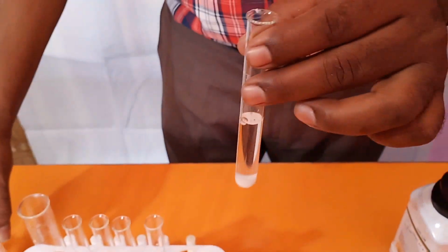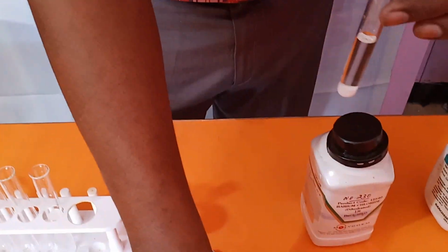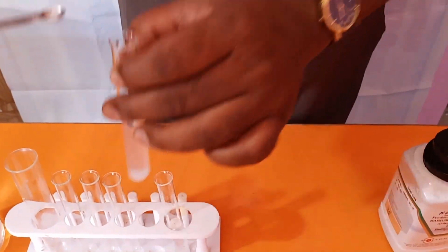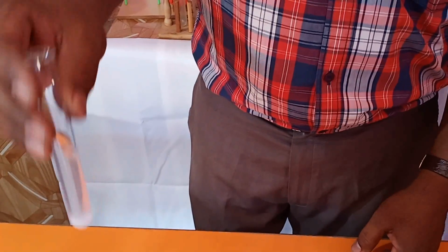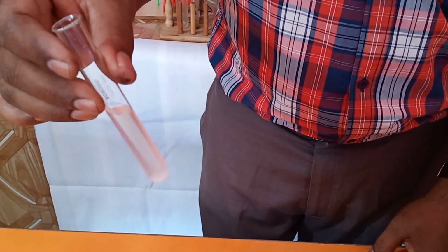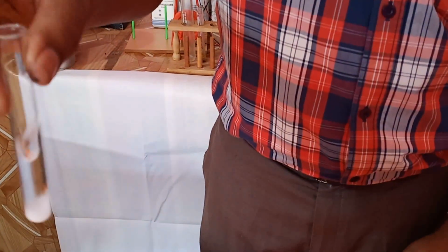Let me stir it well. I will shake it so that it mixes well. This is barium chloride and this is the sodium sulfate.